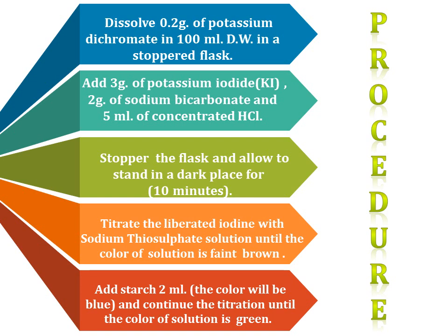After the 10 minutes, before I start the titration, the color of solution is dark brown due to the liberation of iodine.